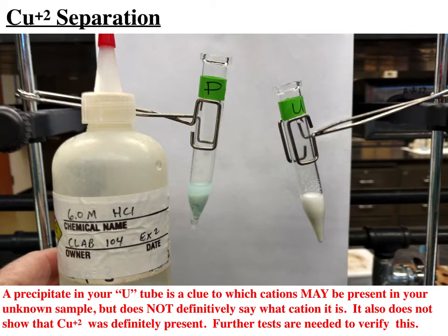So we need to perform a qualitative analysis on this. What we have done for sure is separated the copper from the silver and lead. If copper is present, it will be present in the supernatant above the precipitate. We need a further test to verify whether or not copper is present.